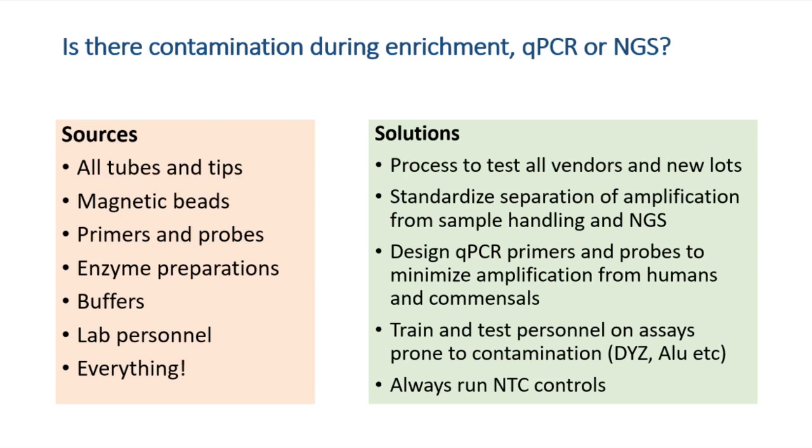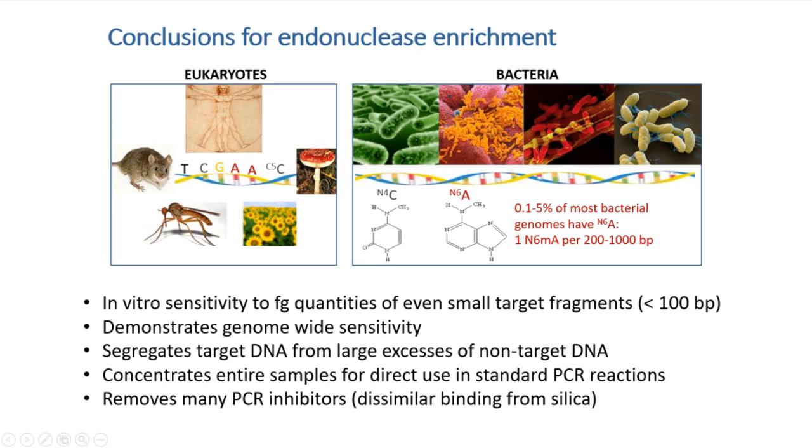And of course, all of these things should have no template controls with them. So probably nothing new there, but it's probably helpful to hear that other people have had things come into their lab, and these are the ways that you catch it and prevent it from ruining an experiment. So, conclusions for the use of endonucleases for enrichment.